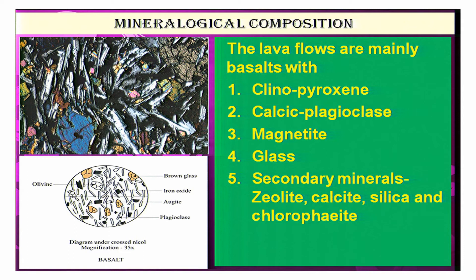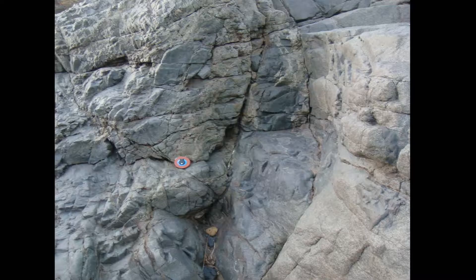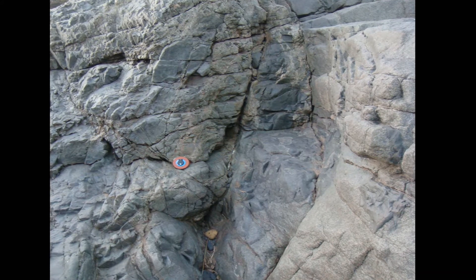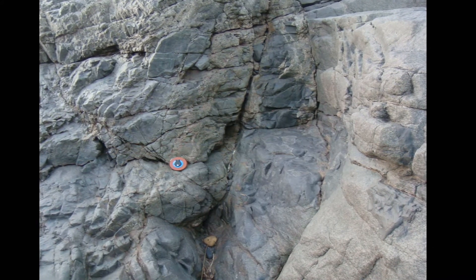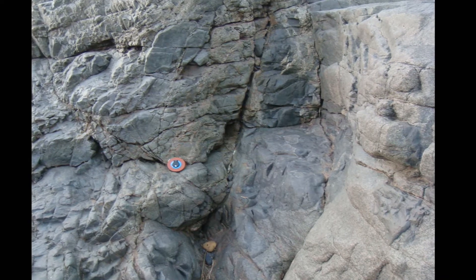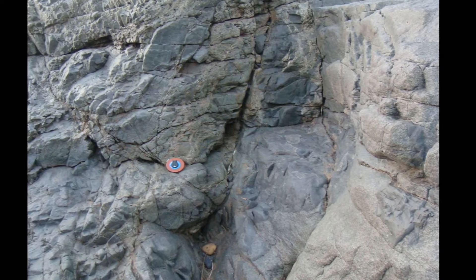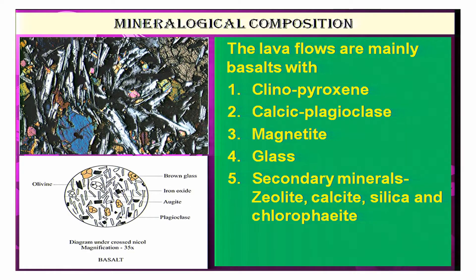See here — a very fascinating and colorful picture. The rock which you see on the surface is black, very monotonous. But when you cut across and make a thin section of these rocks and see under the microscope, you find beautiful colors. These colors represent different minerals.